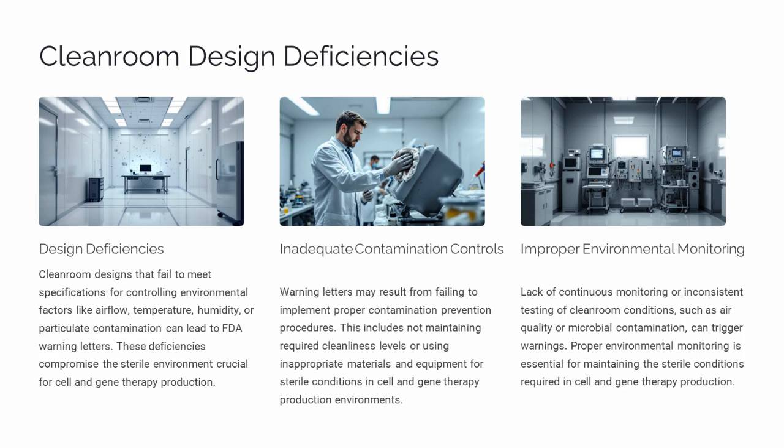This includes not maintaining required cleanliness levels or using inappropriate materials and equipment for sterile conditions in cell and gene therapy production. Lack of continuous monitoring or inconsistent testing of cleanroom conditions, such as airflow or particle counts, can lead to warning letters. Proper environmental monitoring is critical for maintaining the sterile conditions required for cell and gene therapy production.